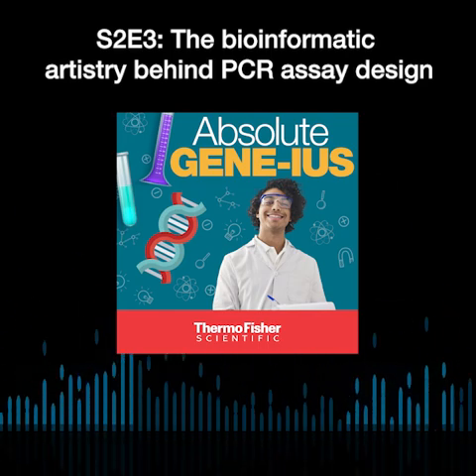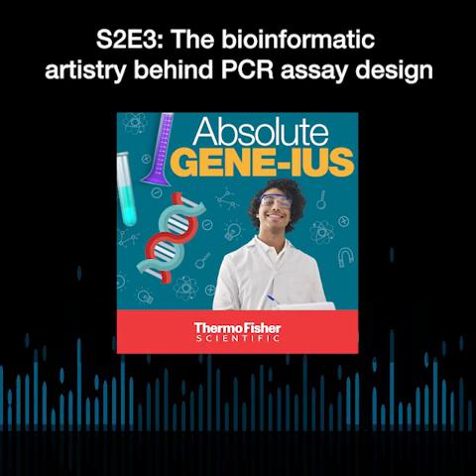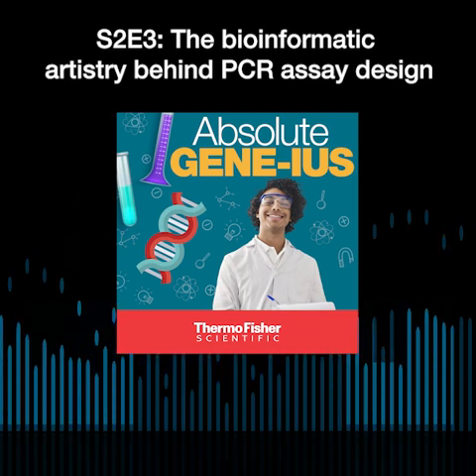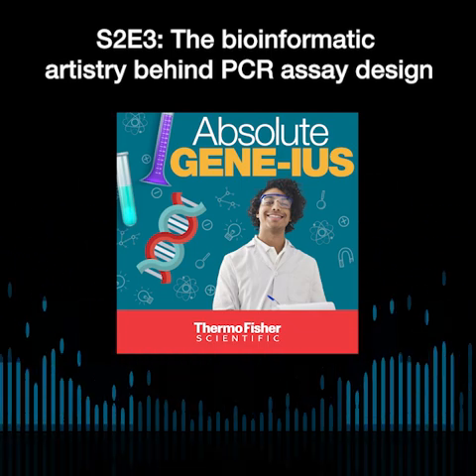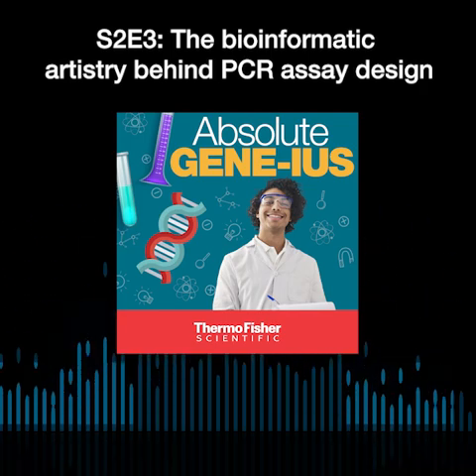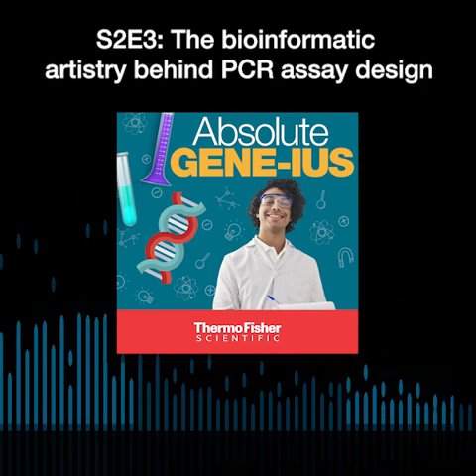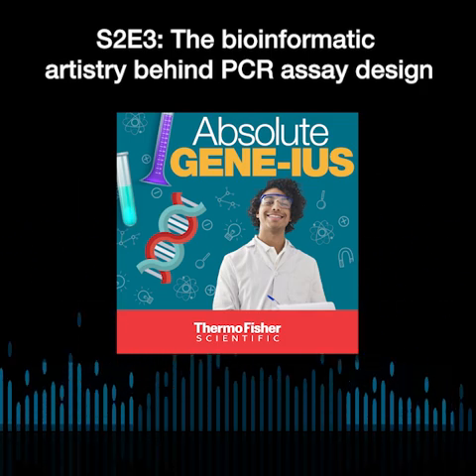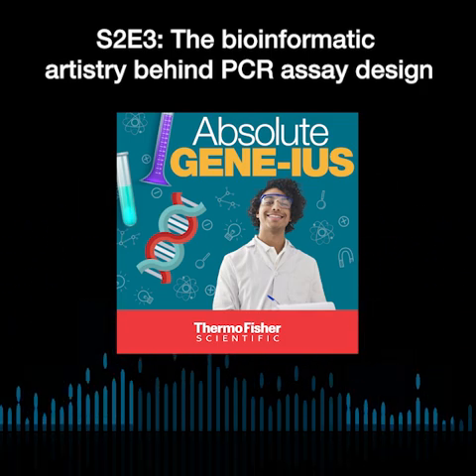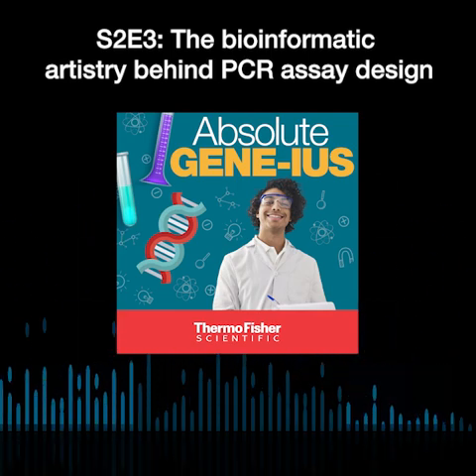Can you explain what are pseudogenes? Yeah, so a pseudogene is another gene in a different part of the genome, but it has a very similar sequence to the gene that you're interested in. Makes sense. So if you're targeting one particular gene, but other genes are very similar, you're going to get amplification of those off-target genes that you don't necessarily want to analyze.